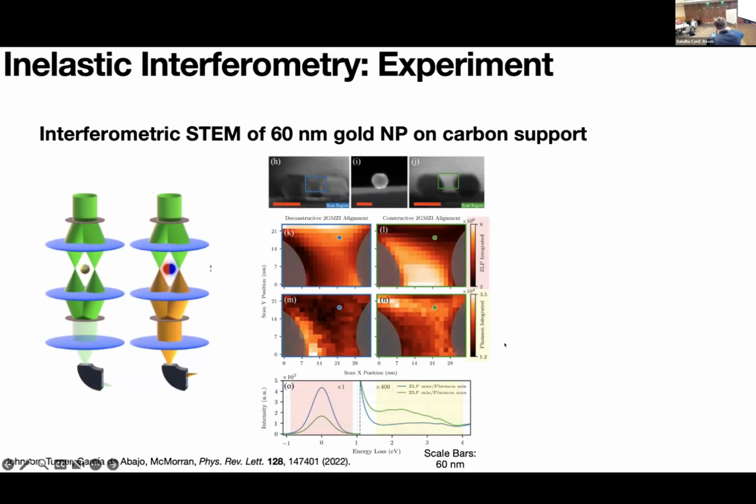Okay, so that middle image here, this is the image that we expect when we just use one beam, or the image that we picked, that's an actual picture. For this picture, we're using the scattered electrons. So those are electrons that interact with the sample hard and they scattered. We use that to form the image. It's a dark field image. Here on the right, this is a bright field image. So we're going to use the electrons that pass through coherently the sample, and we're just going to integrate them. And we see a double image for a sample.